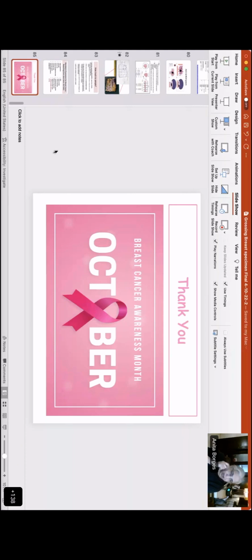I have just one last question for you, Ayushi. I noticed that this is something that the Tata Hospital guys do, and I don't know whether anybody else does that. You showed that you put a lot of formalin soaked cotton in between the slices. Why do you do that?